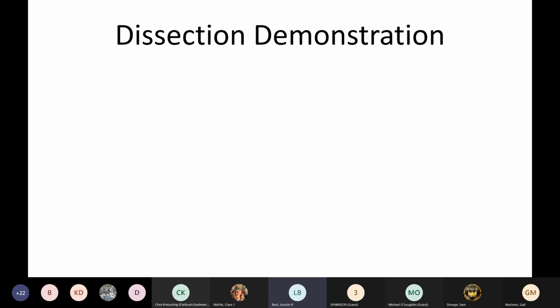Now, the hydration method, one of my main motivators is just to produce lots of data. And so I'm very production focused. I know that I can dissect about 135 male bumblebees per hour. To give you a sense, if you're doing a master's project and you have 2,000 bumblebees and 400 of them are males that you need to dissect, well, with practice, you can probably do 100 in an hour once they've been humidified.